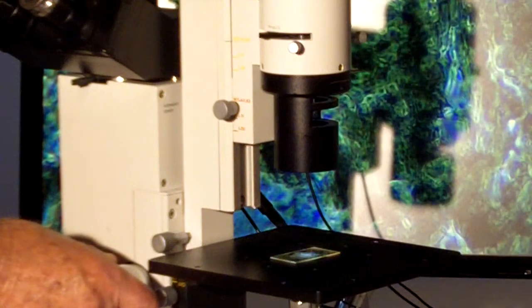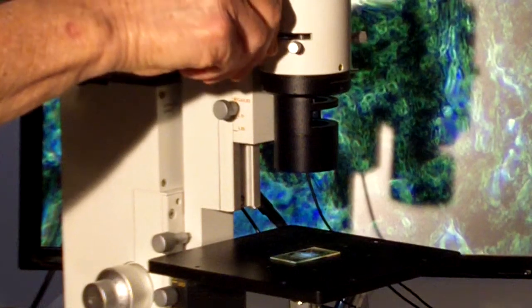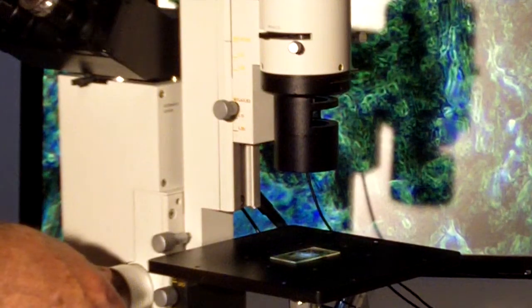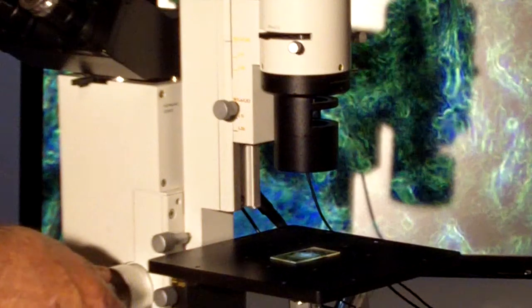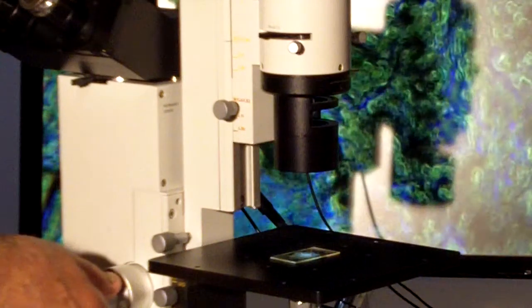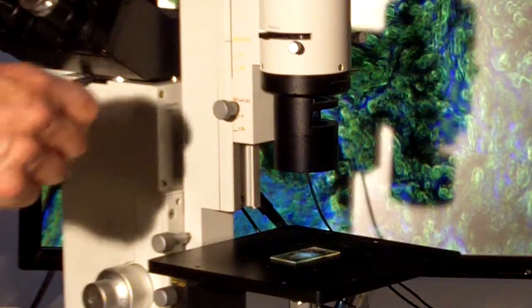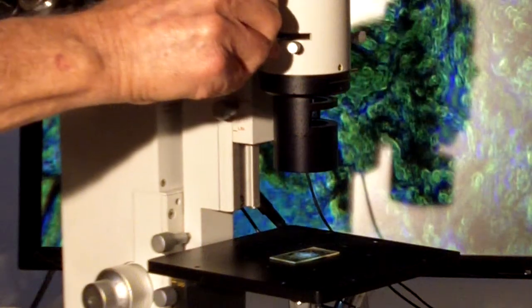Here it is in just phase contrast. We can look at mineral sections and fibers in phase. This is a method they might use looking at trace evidence in a forensic crime laboratory. Let's remove the phase ring at this point and look at it just in bright field.